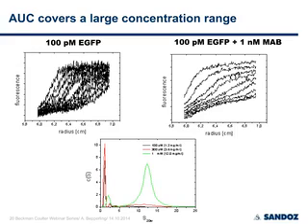So at high concentrations, your formulation may hide some surprise regarding the oligomeric state of your protein, and this is accessible by AUC. And you also may be able to derive binding constants for really weak interactions in the millimolar range and associated to it the second virial coefficient. I'll show you an example afterwards.